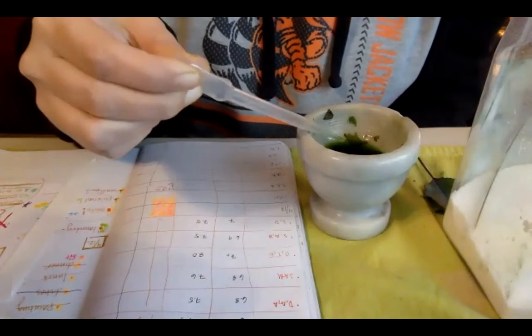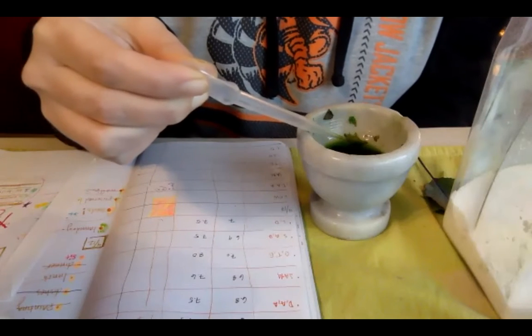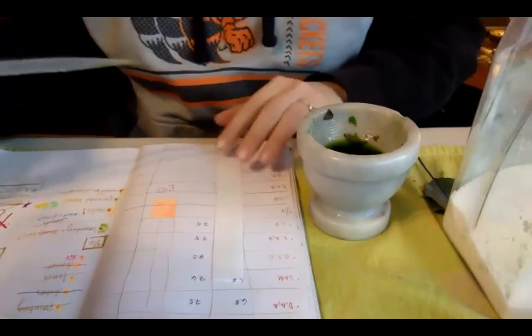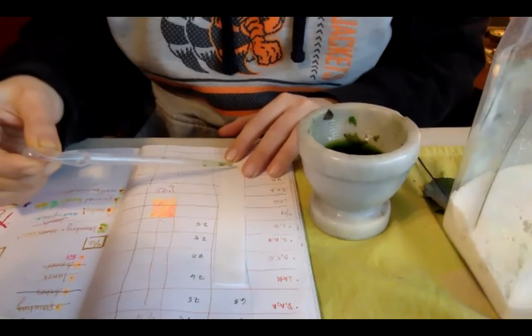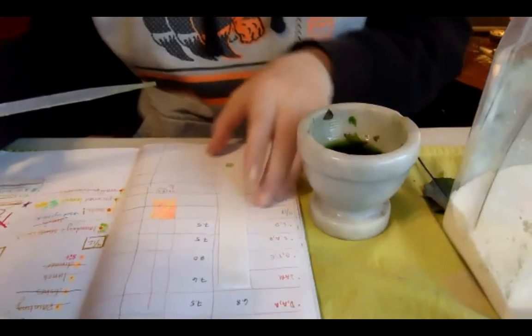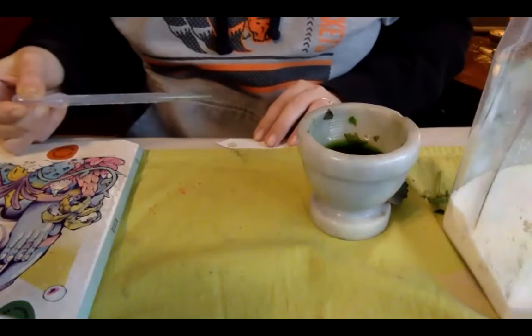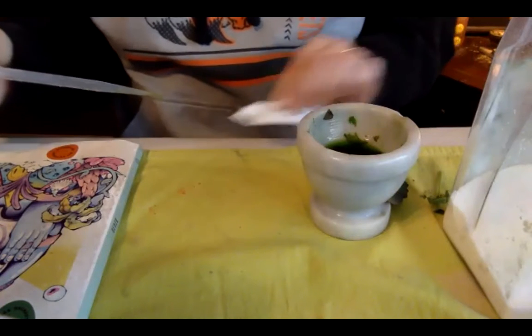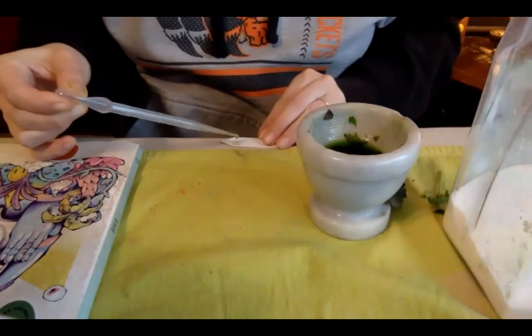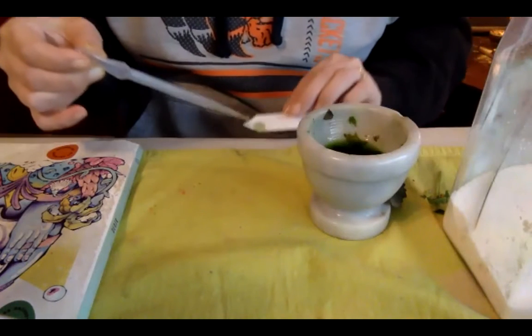Again, I'm going to skim it off the top. I don't need much. I just need a drop. I don't want the solids. And then I'm just gonna, guess it's gonna be a little absorbent and I want a small spot. Not so good. I gotta get it off this paper. I should just keep going. I should let it dry. It just takes a few minutes and I should just keep piling on. I'm a little off center there.